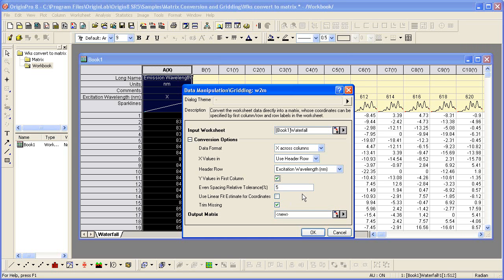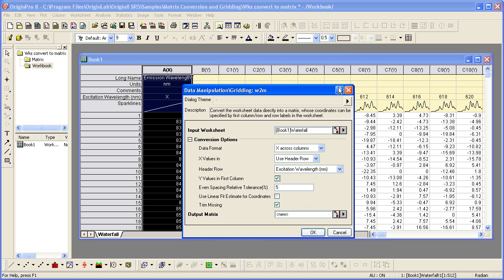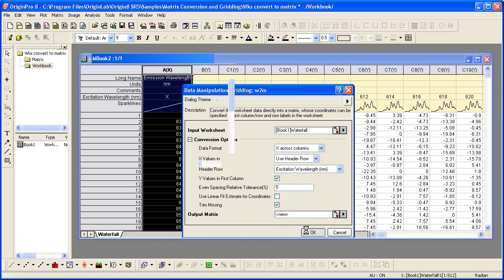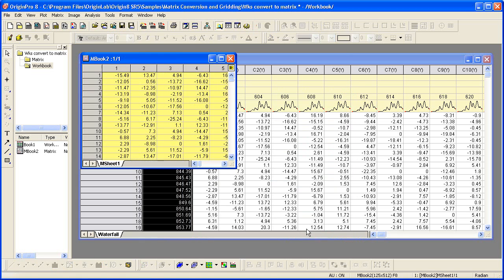Remember the Y values were in the first column, so we check that checkbox. Again, keep in mind that the requirement of the matrix is that your X and Y values must be evenly spaced. Typically in experimental data there is some variation in X and Y, therefore some tolerance is allowed. You can press the help button or the F1 key for documentation to read more about all the conversion options in this dialog. The output matrix is set to new, meaning a new matrix window will be created when I click OK.